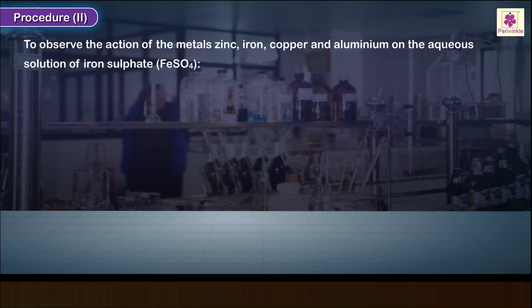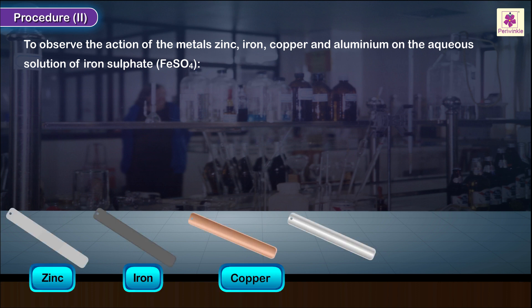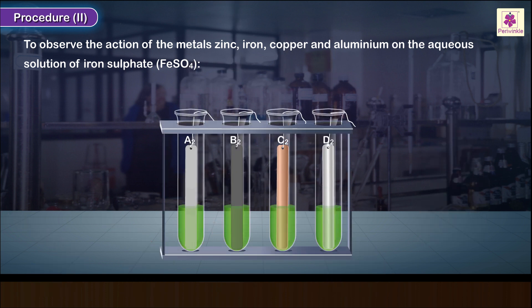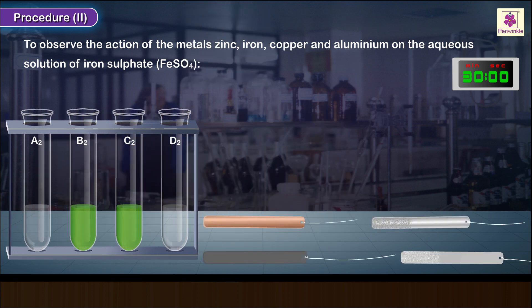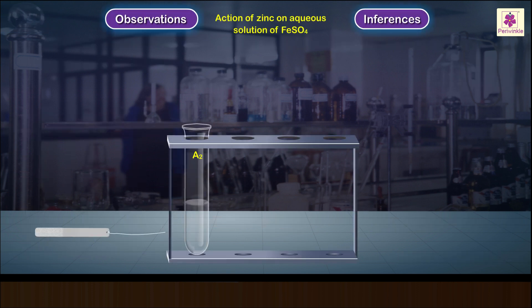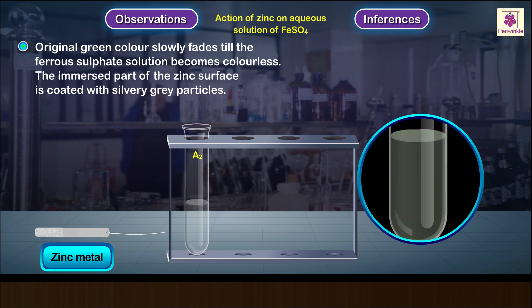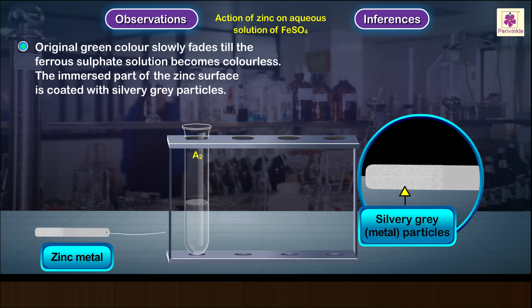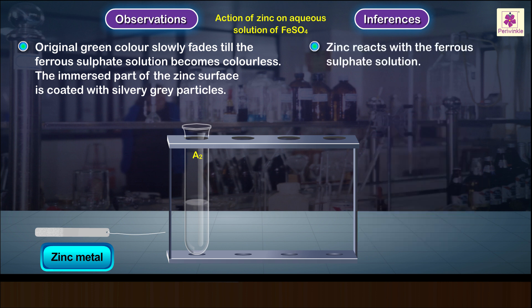Procedure 2: To observe the action of the metals zinc, iron, copper, and aluminum on the aqueous solution of iron sulfate. Repeat Procedure 1 with aqueous solution of iron sulfate instead of zinc sulfate. Carefully pull out each metal strip and observe the surface of the immersed part. Observations — test tube A2 containing zinc metal: the original green color slowly fades until the ferrous sulfate solution becomes colorless. The immersed part of the zinc surface is coated with silvery-gray particles. Zinc reacts with the ferrous sulfate solution.